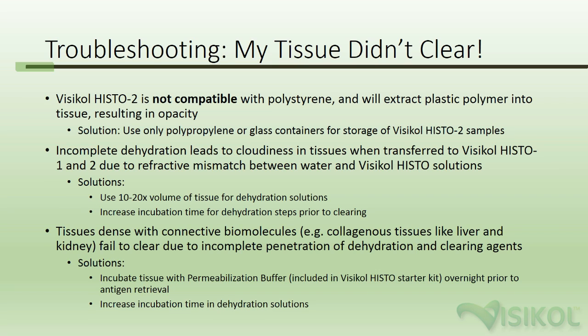You should use 10 to 20x the volume of the tissue for dehydration solutions. You should also increase the incubation time for dehydration steps prior to clearing, and be sure to use fresh dehydration solution, as methanol or tert-butanol tend to soak up water over time.